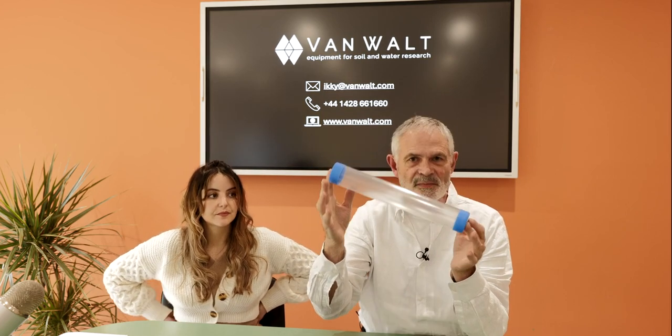Finally, on the accessories. Sometimes you want to take a sample in a liner. You may want to take it in a liner to take back to the laboratory. In many cases, samples will be stored, maybe frozen or used at a later stage, and you want to capture the sample in a liner. This is a transparent PVC. They come in different lengths, they come in different diameters. And just a word on emptying these.